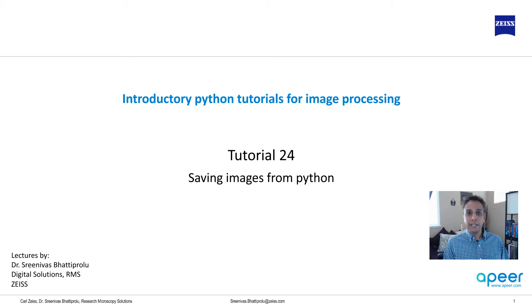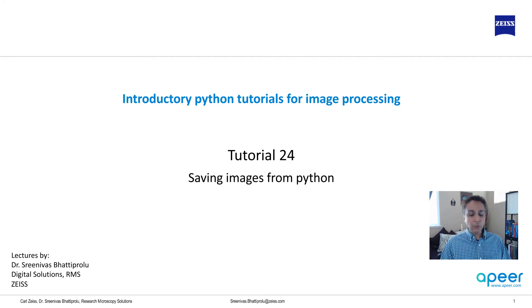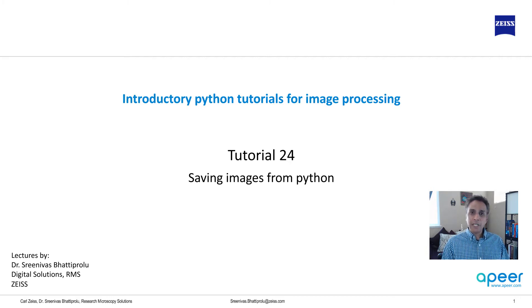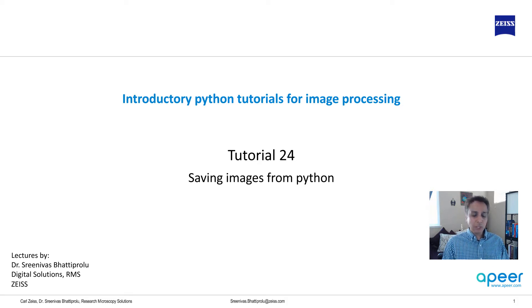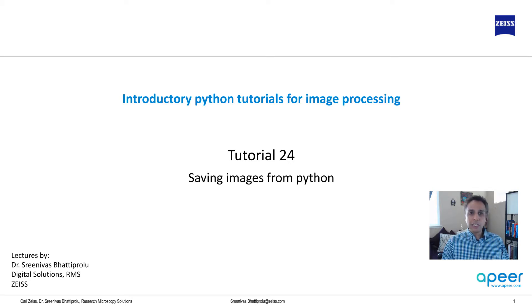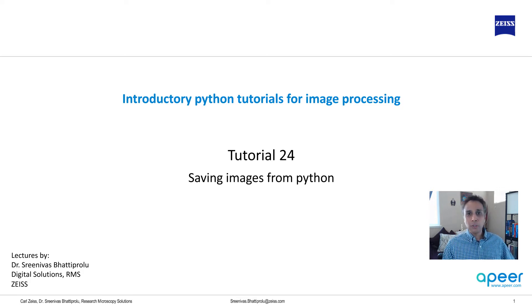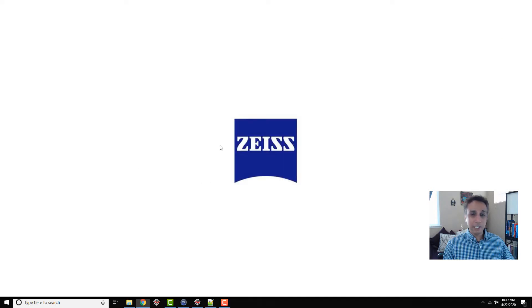This tutorial will show you the process of saving these images from Python onto your hard drive. The two primary libraries we'll focus on are scikit-image and OpenCV. I'll also show you how to save images using pyplot and tifffile. Let's jump into Spyder and start looking at a few ways to save these images.